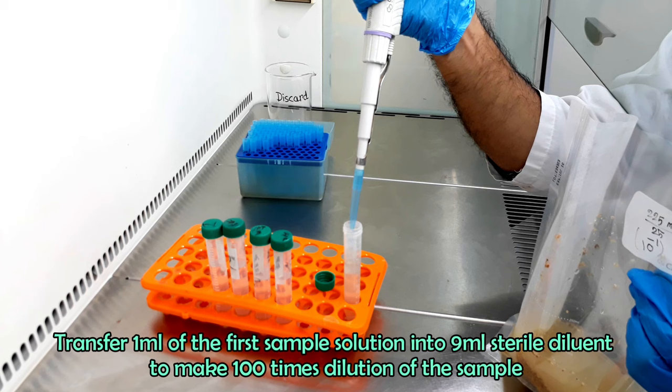Cool the inoculated agar media to be solidified. After solidifying, collect the plates keeping upside down and place inside the incubator. Incubate the plates at 35 degrees Celsius for 48 hours. After 48 hours, take out the plates from the incubator for colony counting.